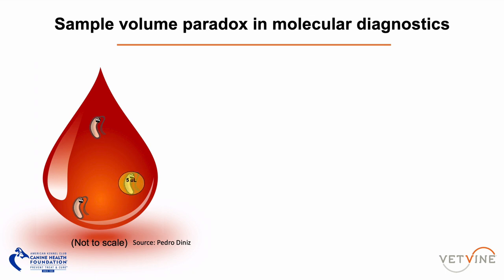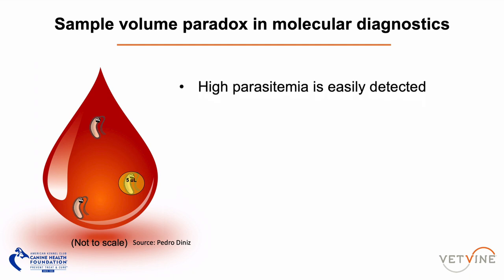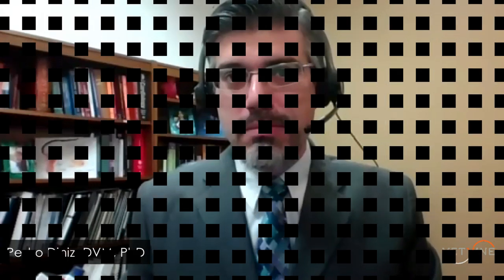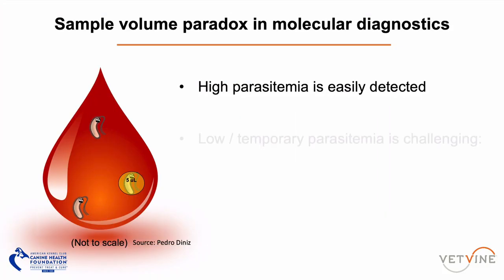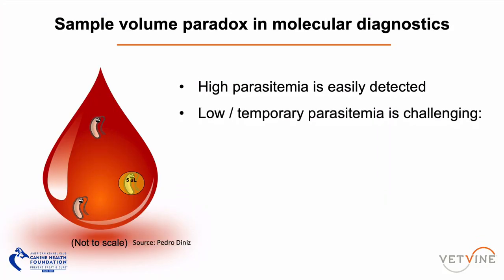In diseases that have high parasitemia — thousands of organisms in the bloodstream 24/7 — molecular diagnostic tests can easily detect it. But if you're dealing with low or transient parasitemia, then it's challenging.